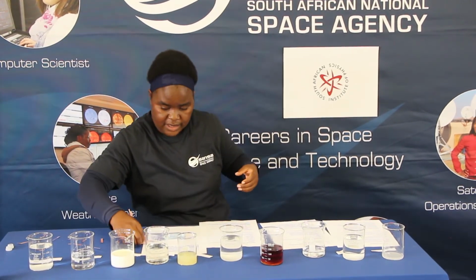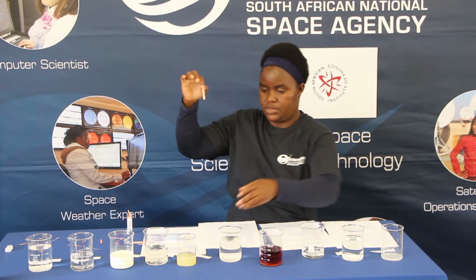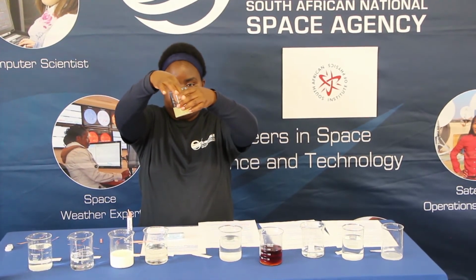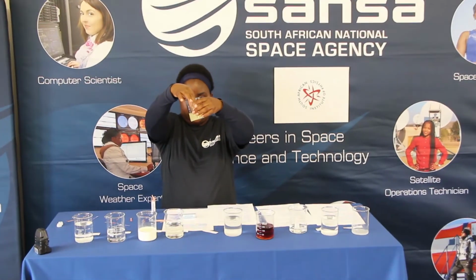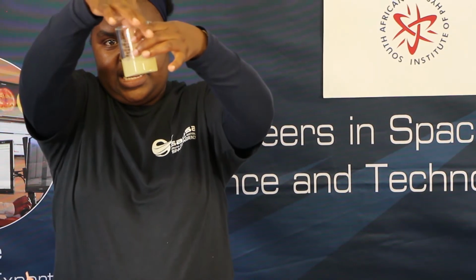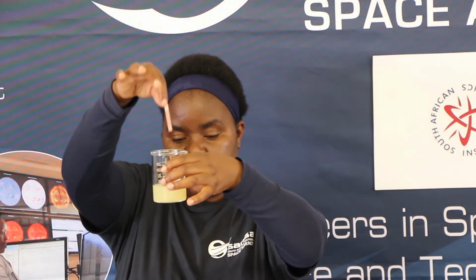And then the next one is the lemon juice. Yes, let's find our lemon juice there. You dip the litmus paper into the lemon juice solution. Can you see what is happening? Yes, there's no change. The paper remains the same.